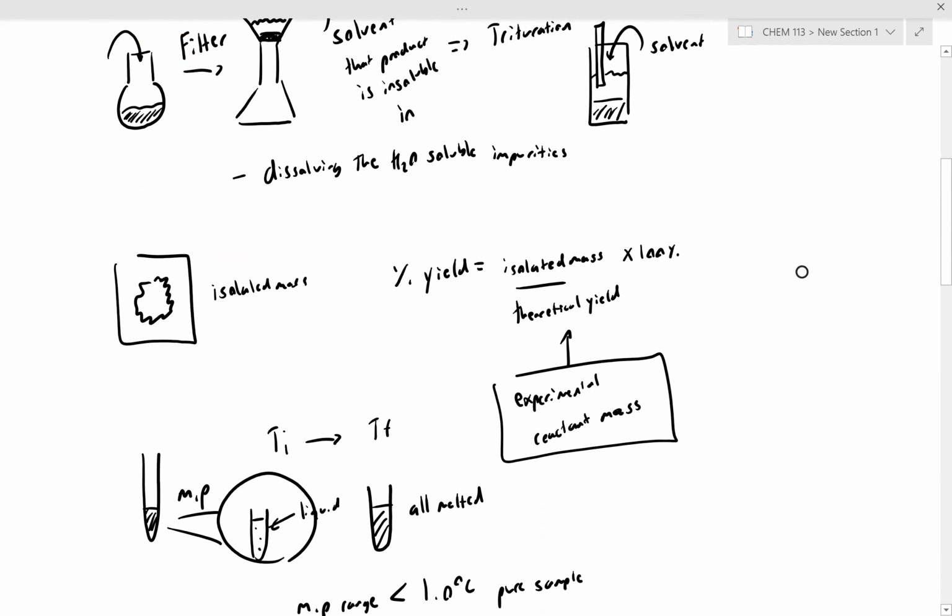Now, once we've isolated our solid after air drying, we'll be able to calculate the percent yield by taking the isolated mass over the theoretical yield. You're going to need to calculate the theoretical yield from the experiment reactant mass from the video. You need to watch the video, and I'm going to expect students to record the exact mass of reactant weighed out in the video. This is important because you don't want to over or under report the yield because you're not using the actual values measured. Does that idea make sense?